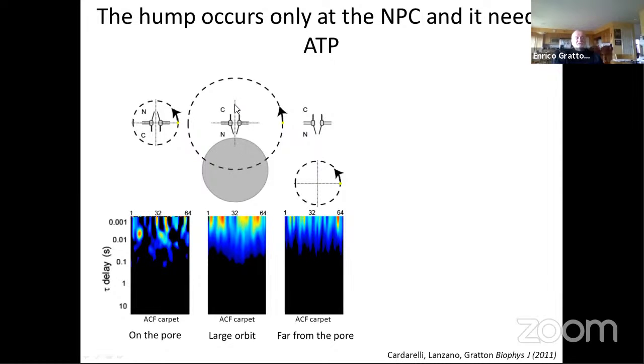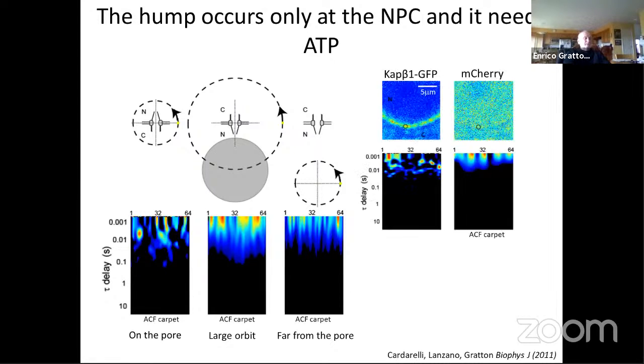And if we continue, eventually things will come back, and then we can measure the time. So we can measure all those times independently, and we can do the correlation in one direction, so point here and the point there, or a point there and the point here. So we can see the direction of the motion and the time it takes for that process to occur.